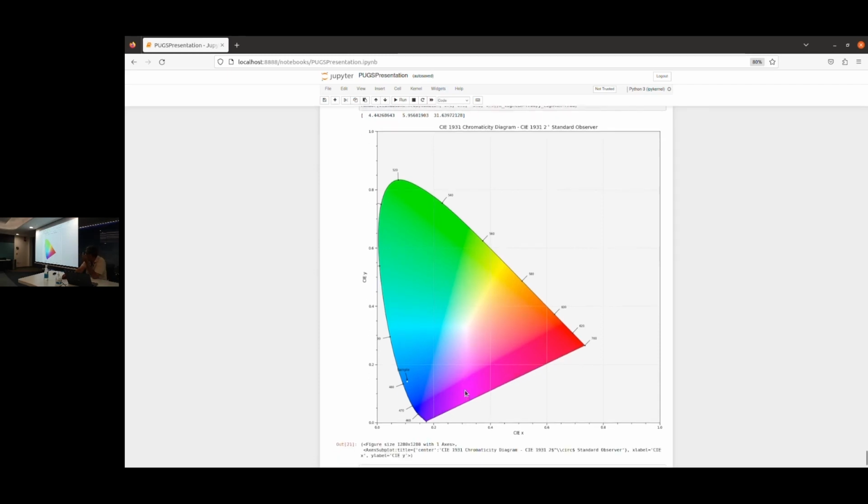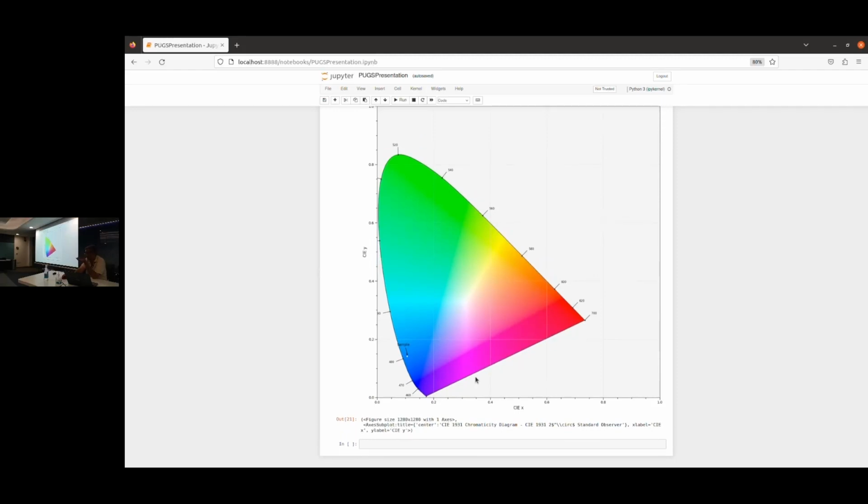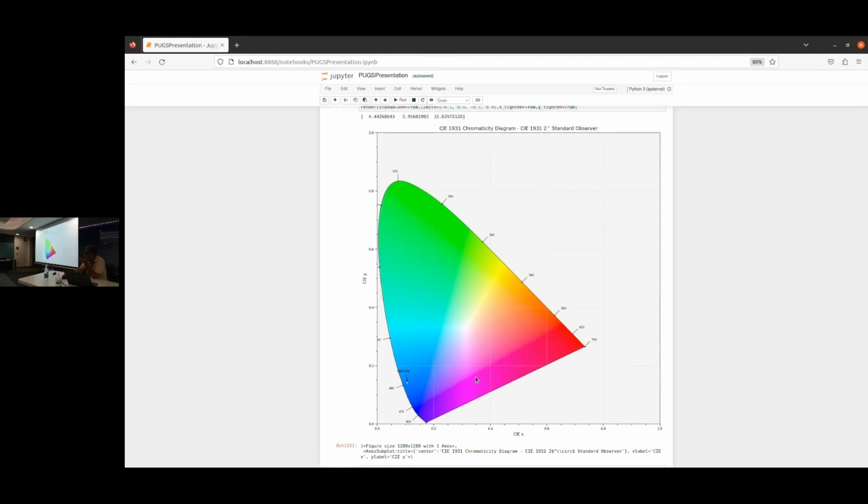So there are these things to customize. Now, this is a visible signal, so visible range spectrometers have less of a problem. If you're looking at near infrared signals, let's say 1 micron to 1.5 micron, you tend to have more of these. The baseline itself may have a trend. If you're looking at Raman signals which integrate for a long time, you start getting trends. So there are other cleaning up of the data that's involved that I have not shown over here before you get your spectral data array that you can then take forward.